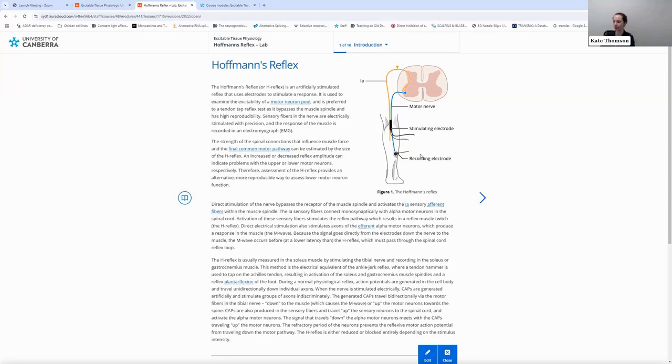The main things we had with this, because this is the first time we've run this, is obviously a lot of difficulty with the stimulating electrode for quite a few students. Some of them, it worked fine. They put it on immediately, got the response. Others had to fiddle around for quite a while, but that was a good example of, oh, everyone's bodies are slightly different. You have to experience it. It's a little variable when you look at biology.